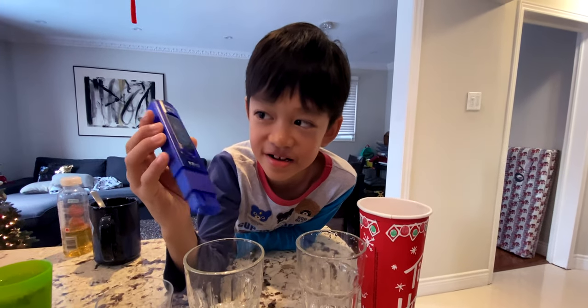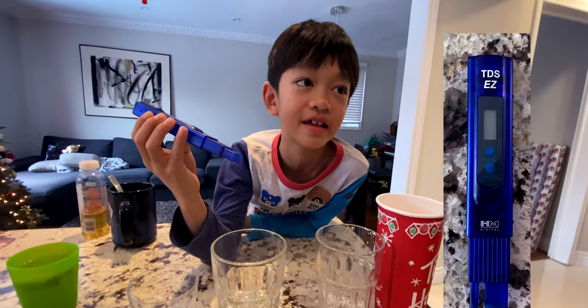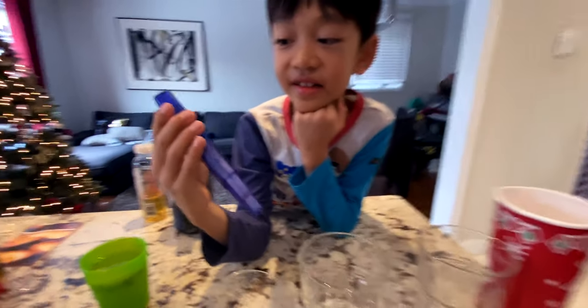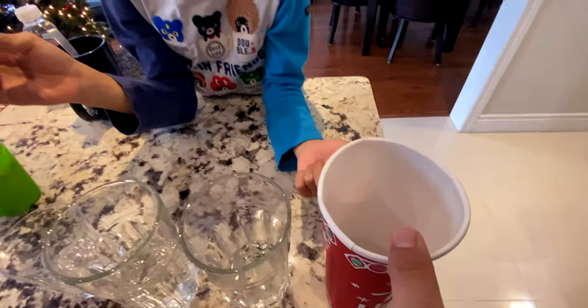Today we're going to do a water test with this water testing device. Is it at zero? Yes. This is snow water — we actually took snow from outside and melted it.